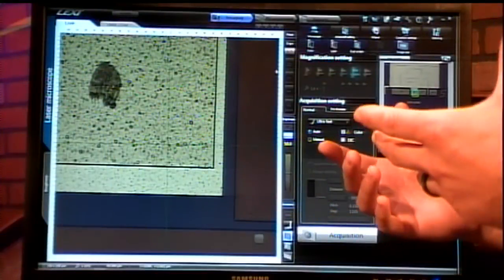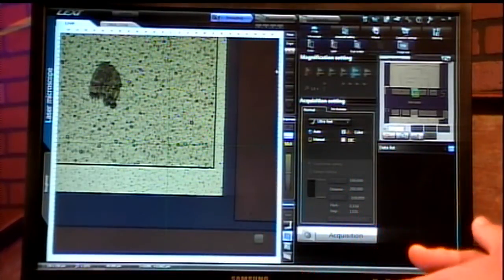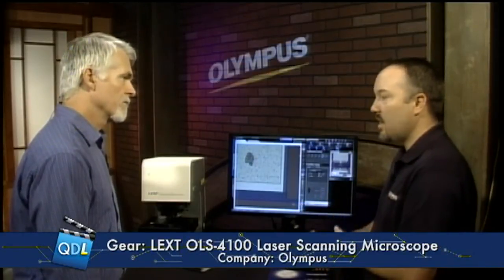And what kind of accuracy do we have? This system has 10 nanometers in Z for height and depth measurements, and 120 nanometers lateral resolution. It's capable of very high magnifications. There are three lens choices that Olympus actually guarantees the repeatability and accuracy specs on. It's very important that a measurement tool, especially in R&D fab, guarantees its measurement accuracy — you don't want to take measurements and not know if they're right or off by a few percent. When the system is set up, the engineers perform test scans on traceable standards, and those guarantees are brought forth on all three high-powered lenses. Since we're an optics company, we manufacture the lenses specifically for this laser tool and can guarantee the results. The 20x, 50x, and 100x objectives are all corrected, which allows us to spec, guarantee accuracy, and repeatability.